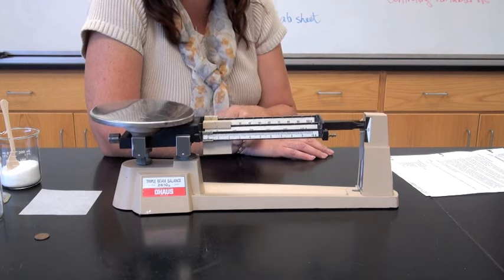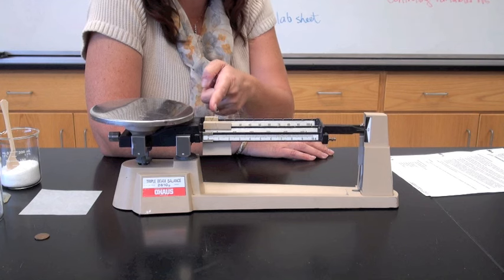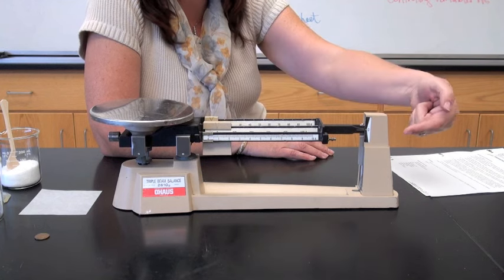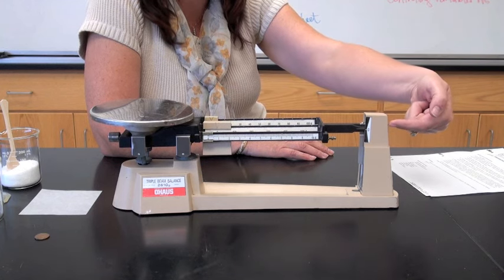When you start to use your triple beam balance you always want to make sure that all of the riders are pointing to zero, and that the zero marker is also resting at zero.